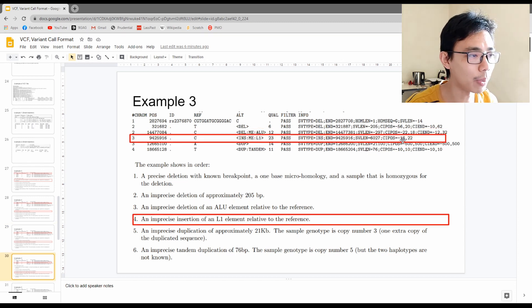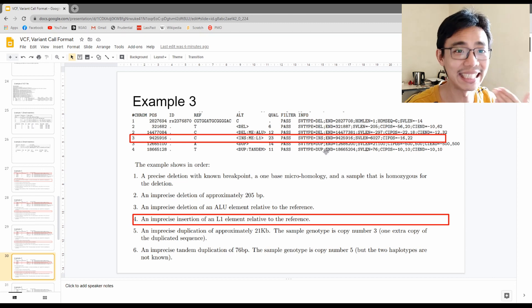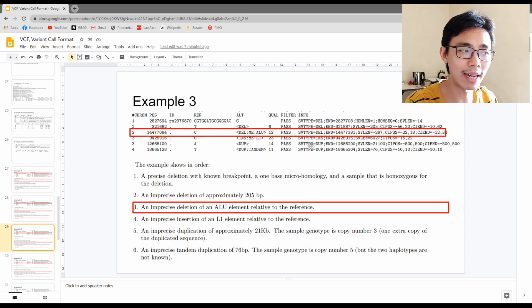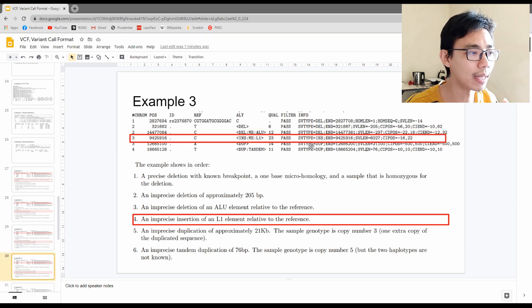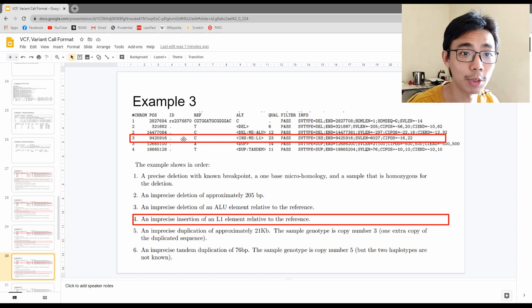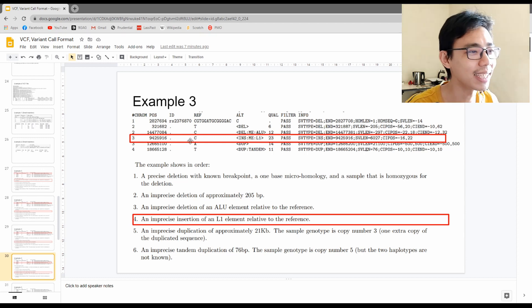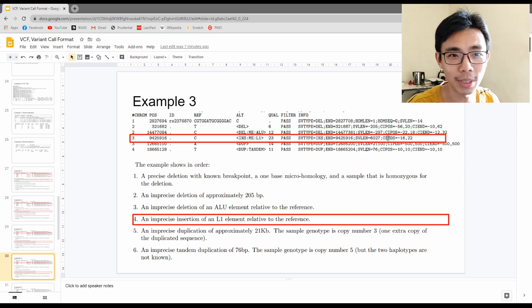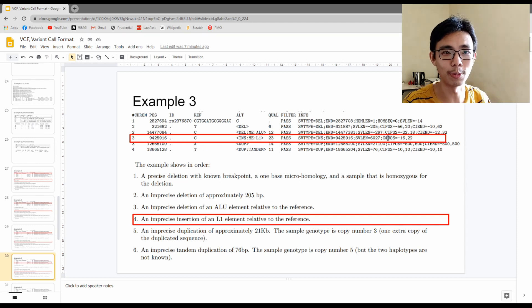The fourth scenario is the reverse — looking at the INFO field, the SV type is INS, meaning insertion. When we talk about ALU element deletions and L1 element insertions, this case starts from C at chromosome 3, position 9,425,916, with an insertion of length 6,027 — a huge chunk of insertion at this position.